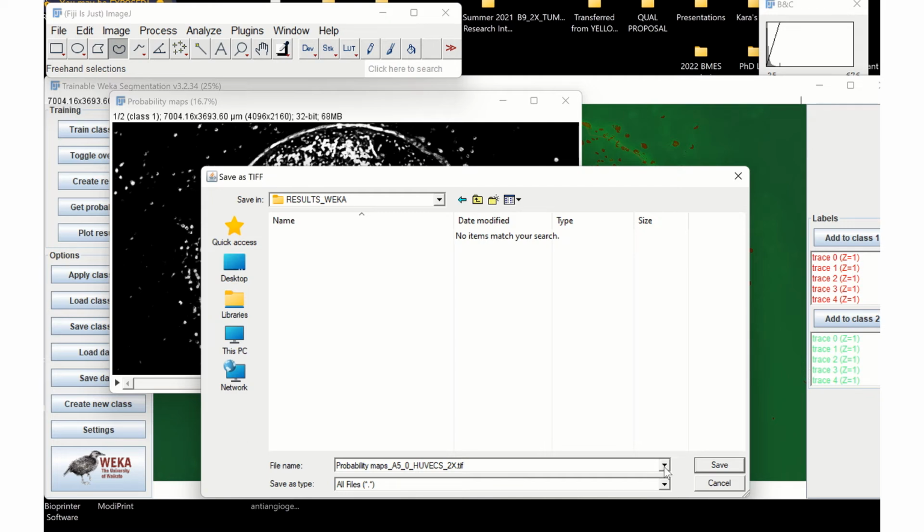And wait, is it .tiff? No, I don't put .tiff because I'm not sure what type of file this is and I don't want to mess with it. So I'm just going to put save.